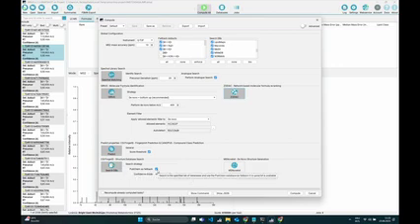And if this is enabled, if we don't get any good hits with the bio databases, it will then search in PubChem to maybe find a better hit. This is the confidence mode that Markus talked about, and we will see some examples soon on this. And last but not least, the MSNovelist button to make de novo structure generation.